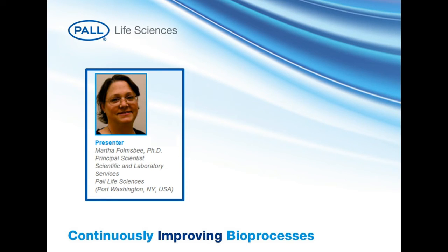And the second stage of establishing a sterilizing grade filter performance is that of a process-specific test, where the filter is tested under the conditions of actual use with actual product when possible. This is a filter validation or a filter qualification test. The integrity test, like a forward flow or bubble point, is performed on the individual filter at the time of use.